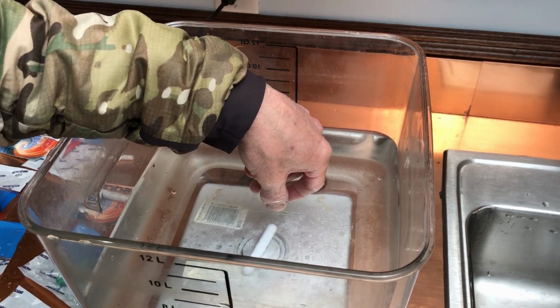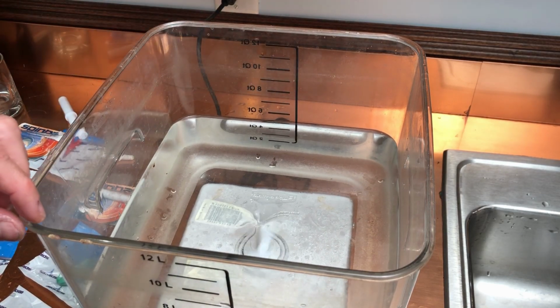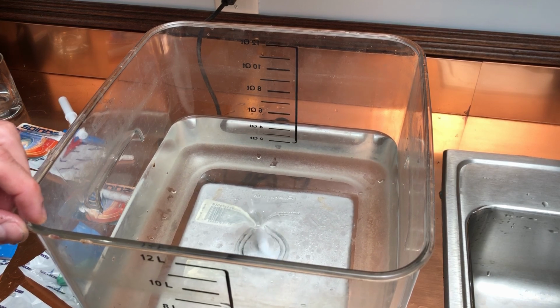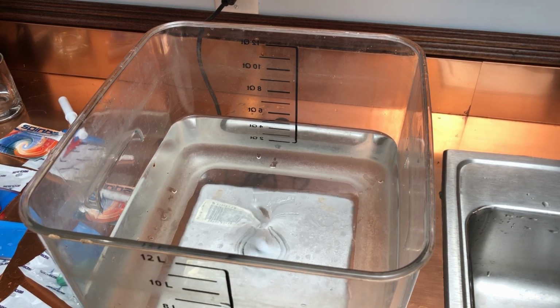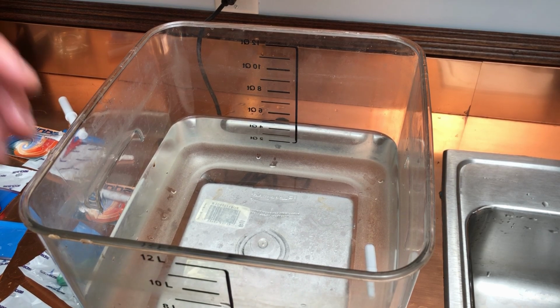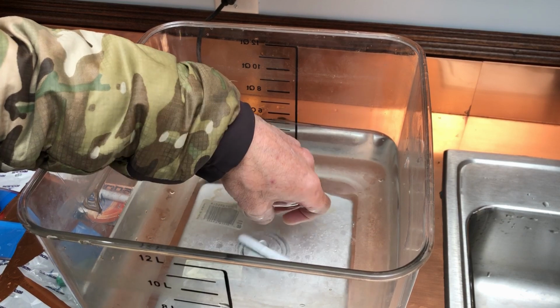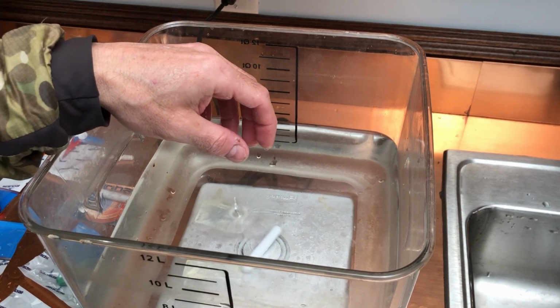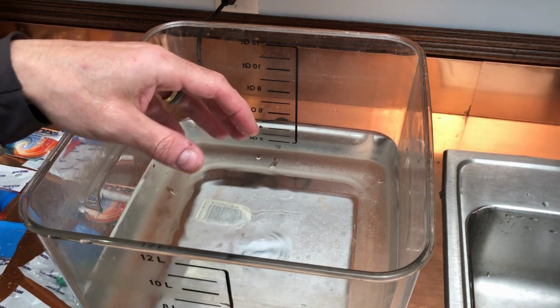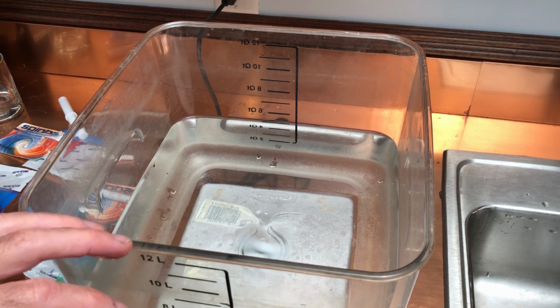It's moving more water per rotation, but it can't go as high a speed without spinning out. A little bit stronger vortex. Now the vessel size also matters. If you had a really small vessel, like a small beaker, it might stay spinning more easily because the walls of it help keep the forces going. But I did try it in a Pyrex beaker, and there really wasn't much of a difference. So I think the most important thing is to have the vessel floor be thin. And this one is thin. It's as close as I can get to the plate.